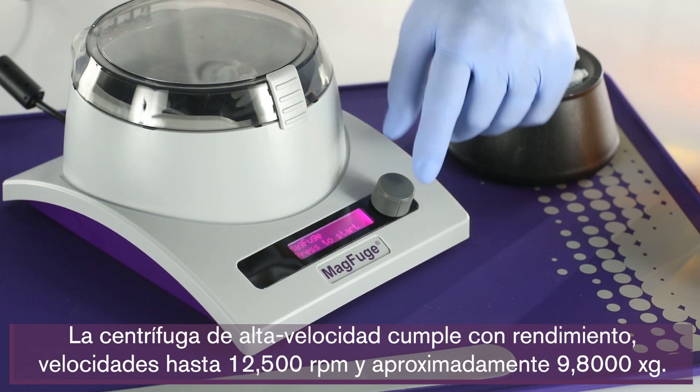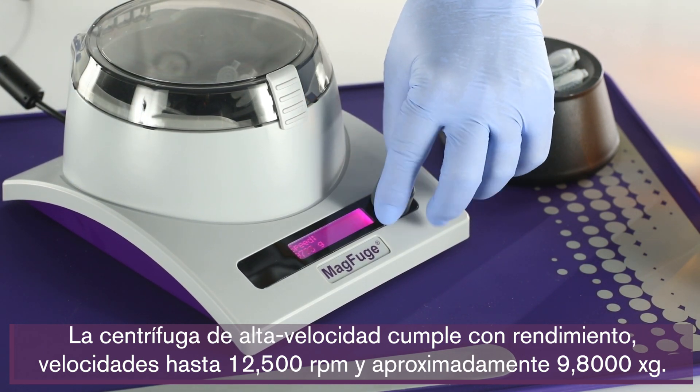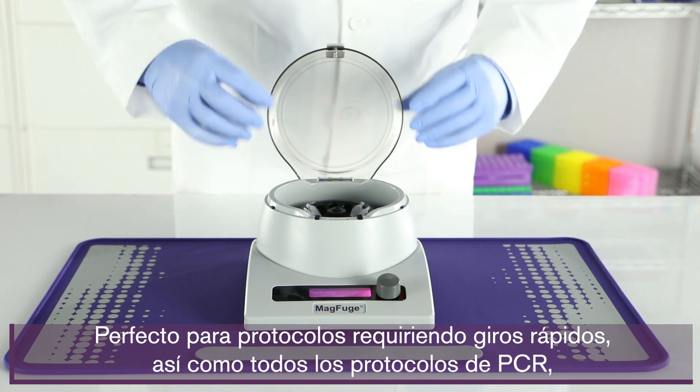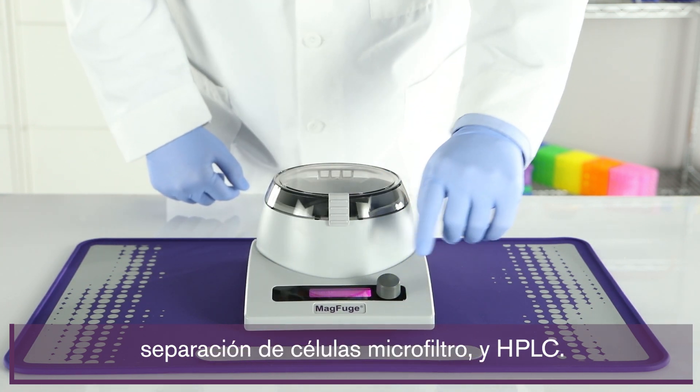The high-speed centrifuge delivers on performance with speeds up to 12,500 rpm and approximately 9,800 g-force. Perfect for protocols requiring fast spins, as well as PCR, microfilter cell separation, and HPLC protocols.